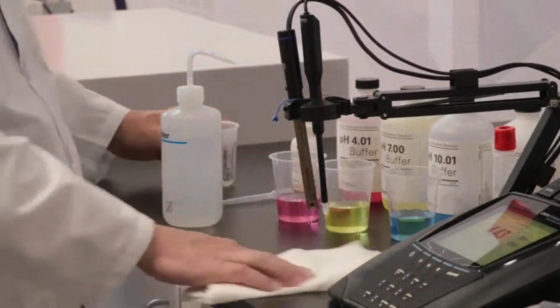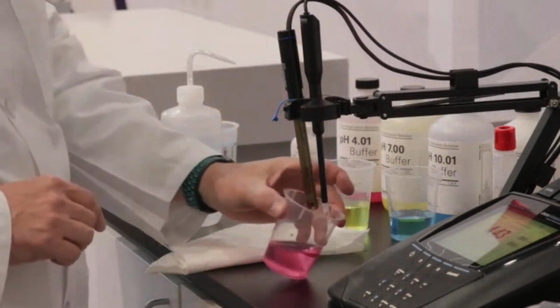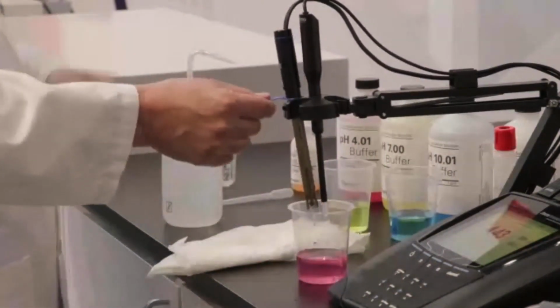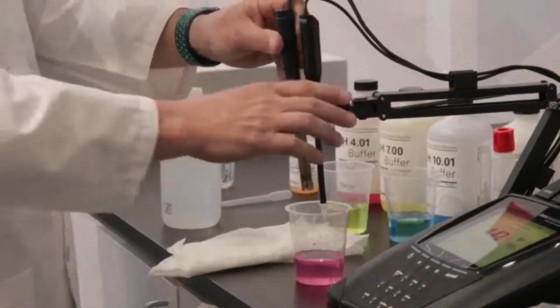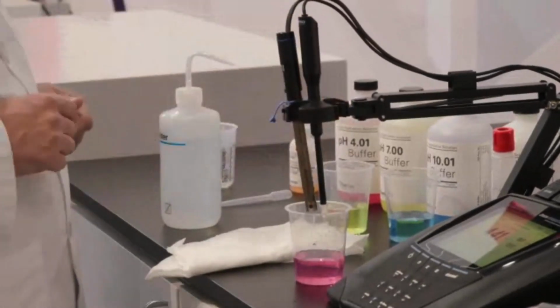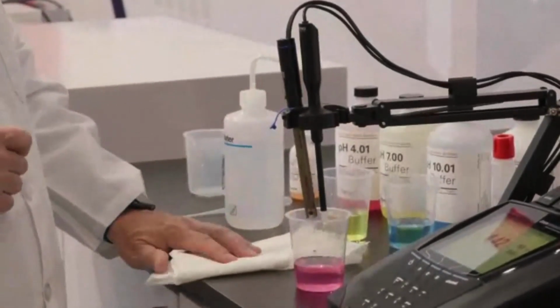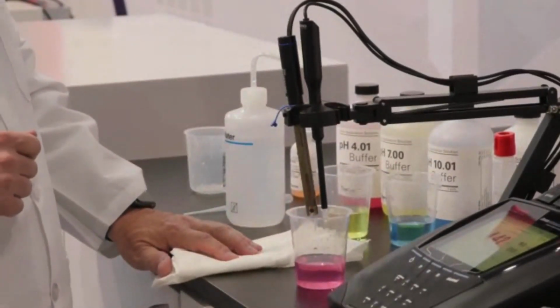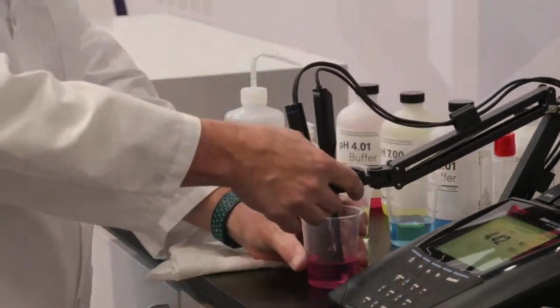Okay. So I see, Steve, you've opened the fill hole. Can you just demonstrate the fill hole there? Yeah, there you go. So when it was stored, he had that closed, and now he's opened that. And that just allows for the electrolyte fill solution to flow down into and saturate the junction. Great. Okay.